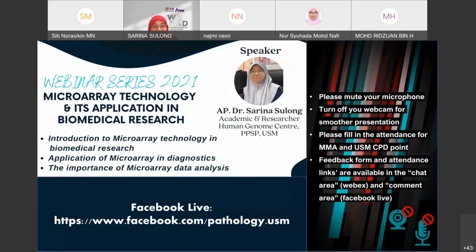Dr. Sarina, I have one question. Is it okay to ask? I'm interested in your last slide where you mentioned big data. Last week we learned about NGS, and this week we learned about microarray. Both technologies are very important in terms of generating big data. In Bahasa Melayu, we call it penghasilan data raya. You also mentioned the role of the bioinformatician, bioinformatics data analysis, that we can chip in terms of analyzing the data.